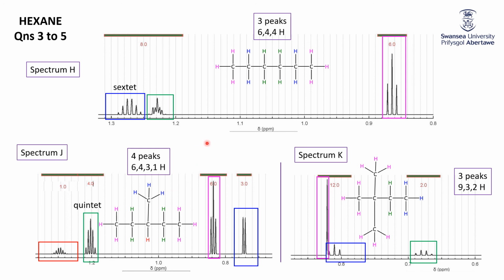Okay, so that was the hexanes. Hopefully the analysis made sense. This really is something that if it hasn't clicked, it will click. And when it clicks, it becomes fun. But hopefully going through them at the pace that we did will help with any misconceptions or misunderstandings.